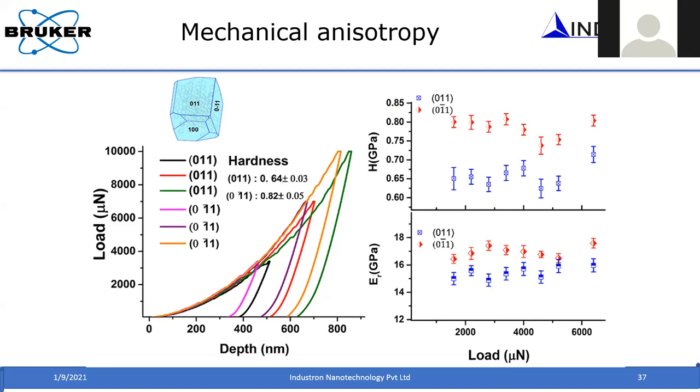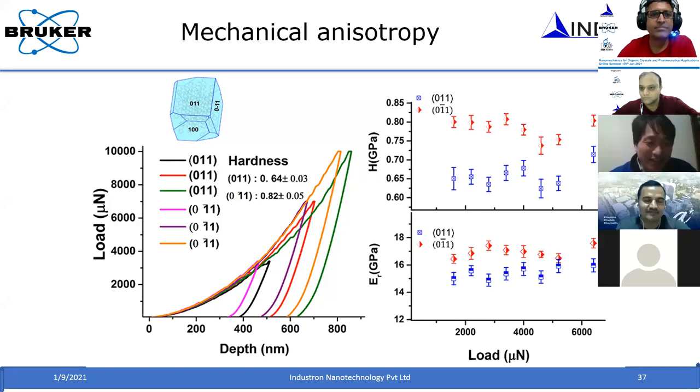Well, I think probably both. For example, if you want to reduce a particle from size A to size B, and if that size B is 50% strain, you can get how much energy you need to put into that sample to make size A to size B at 50% strain from the load-displacement curve. The area under the curve will give you that. Also, when you are compressing, if the particle fractures, that gives you the fracture energy, the amount of energy you have to put in to get that fracture. You can do that with the particle compression.